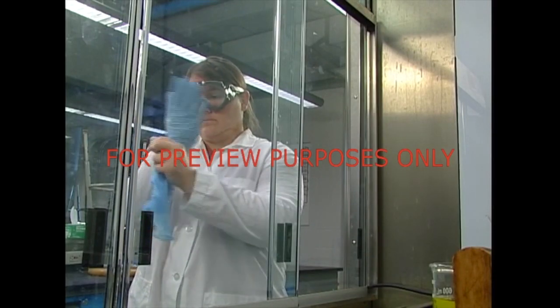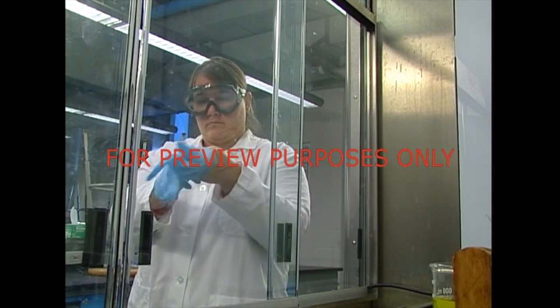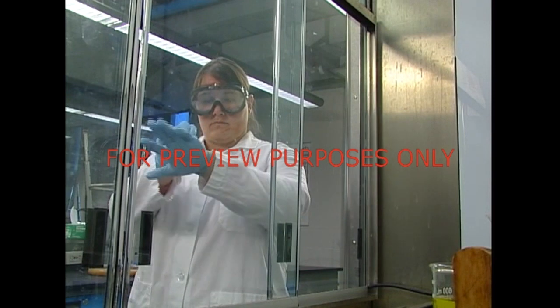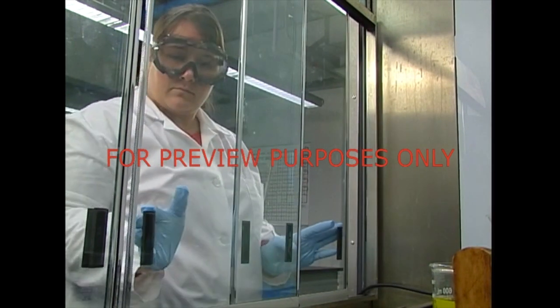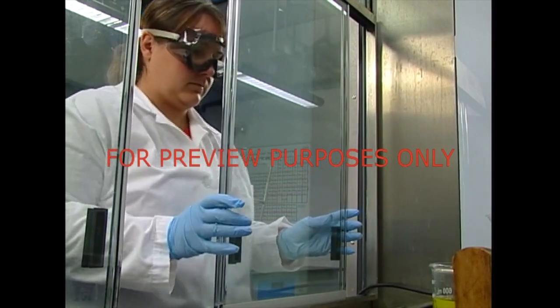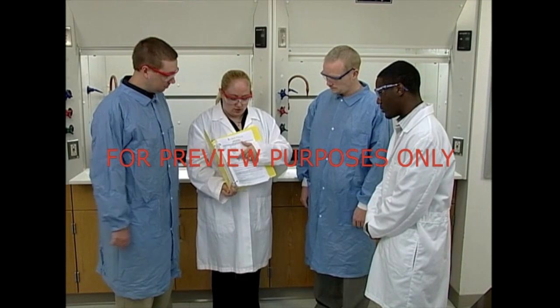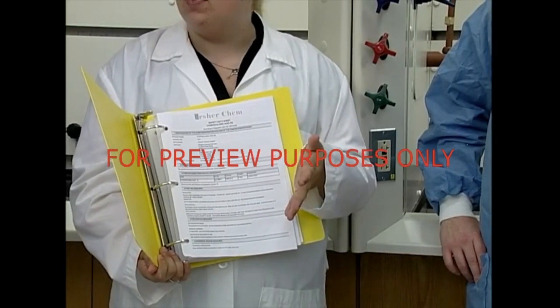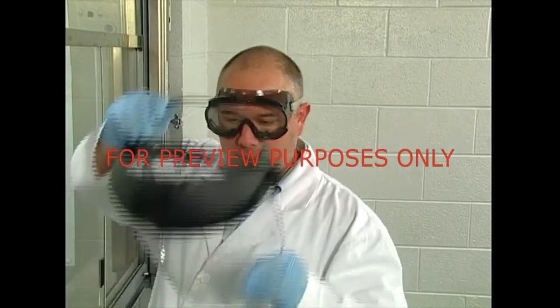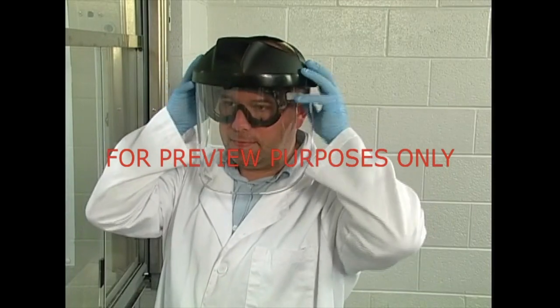When working within a hood, don't forget to wear the personal protective equipment that the materials you're using call for. Even with a hood's protection, you need to wear at least the safety eyewear, lab coat, and gloves that you normally use. You should also read the substance's safety data sheets. These will tell you each substance's ingredients, properties, and hazards. And if the substances you're working with require additional protection, you should use it as well.